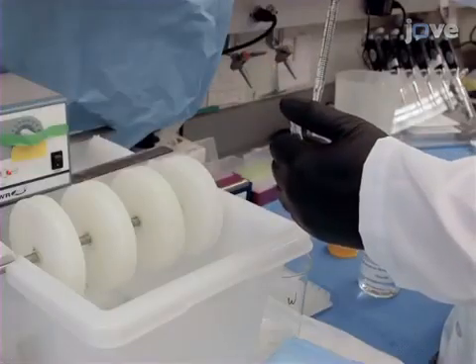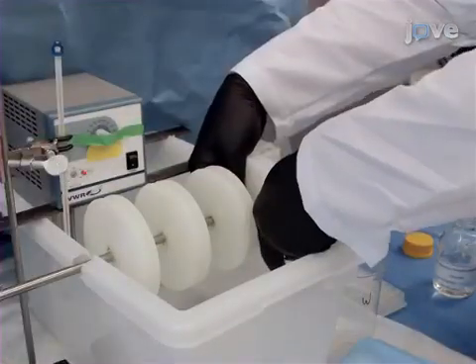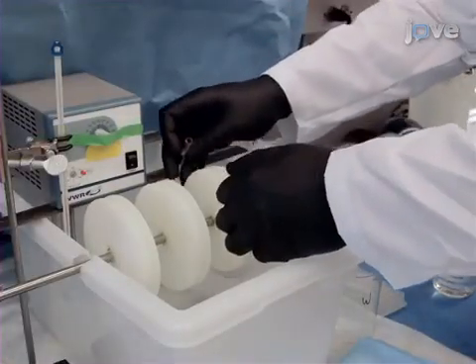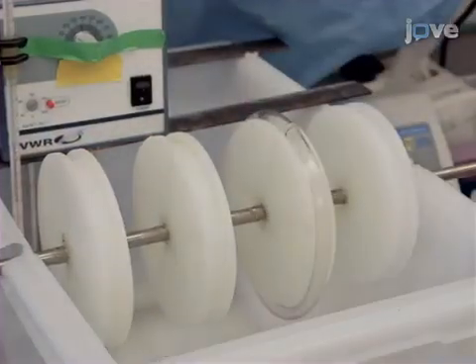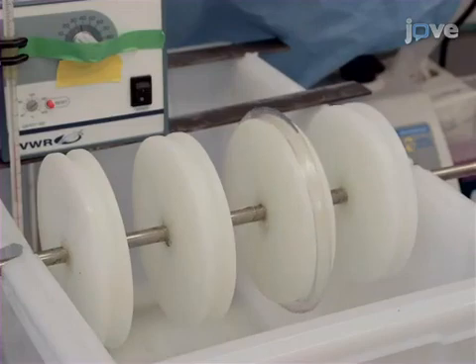Soak tubes in a 0.1% aqueous solution of hexaseal pyridinium for 90 minutes at room temperature on the Chandler Loop apparatus. Rinse the tubes with sterile water three times after the 90-minute soak.